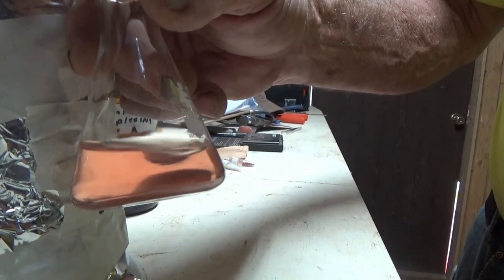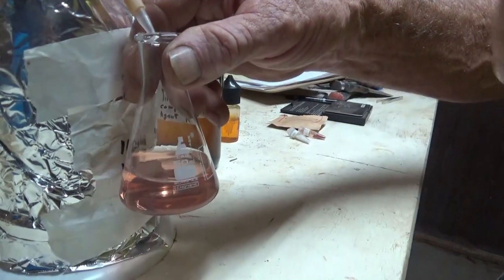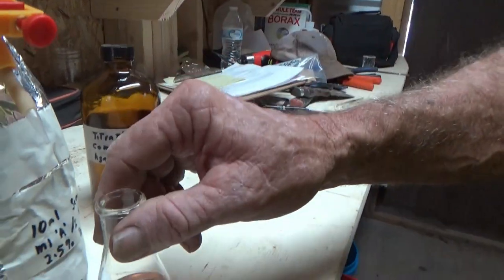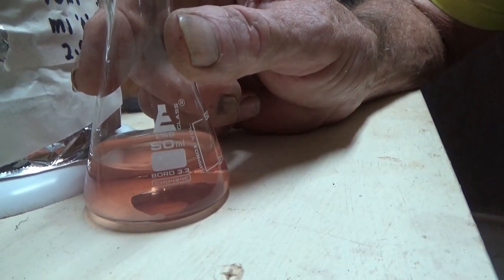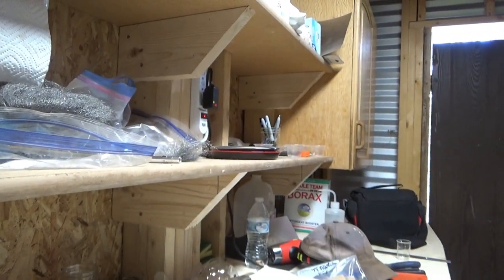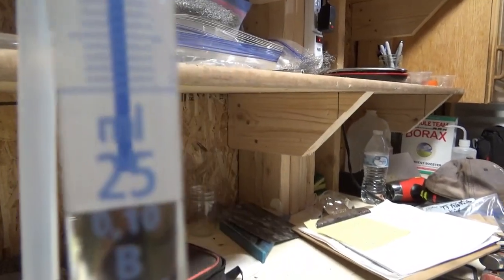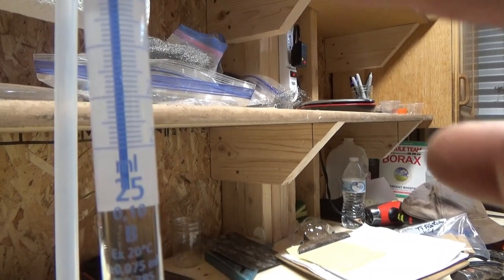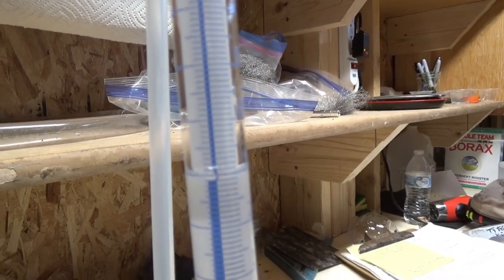There we go. Okay. Hate that knob on the bottom there. So now you see the color change. And it was right at about 20 milliliters. So that would have been 10%. Why are you so close? Because you wanted me to get the graduations and the numbers. How about up there? Where the thing is.